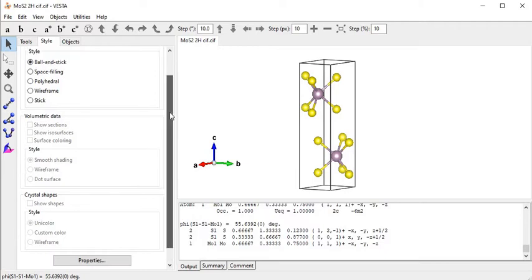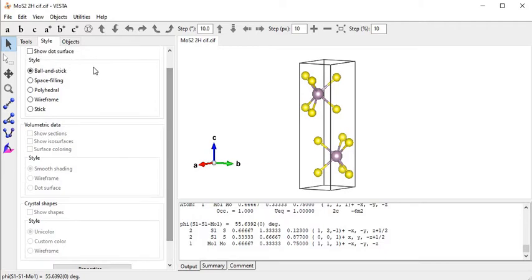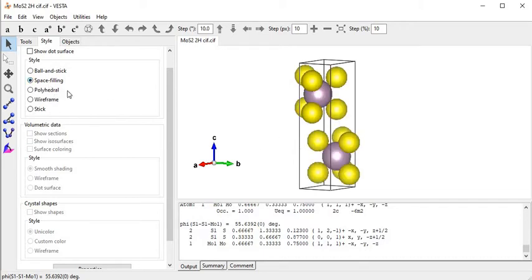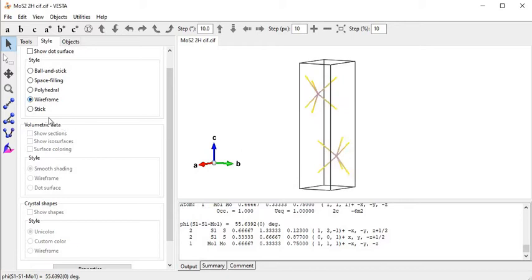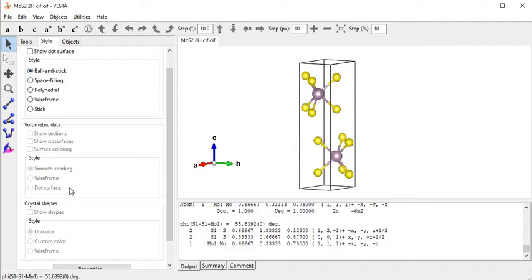Now I come to the style features. We can view this structure in different styles: ball-and-stick, space filling - if we click on space filling it looks like that. If I click on polyhedral it looks like that. This is the wireframe structure and this is the stick structure, which is the most commonly used.